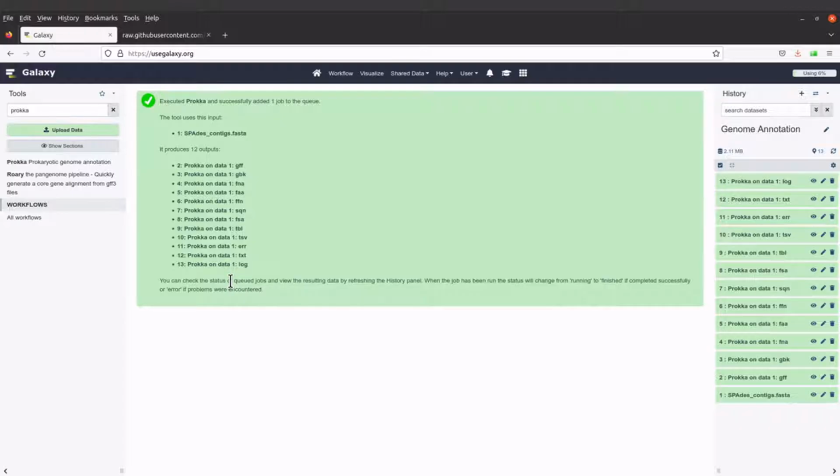So basically, after annotation, you can use that information to get what genes have been predicted, proteins, etc. So this will help you to understand your data better. And then you can also do some comparative analysis. If let's say it's a bacterial genome, like what we are doing now, then you can compare the features you have with that of other isolates.